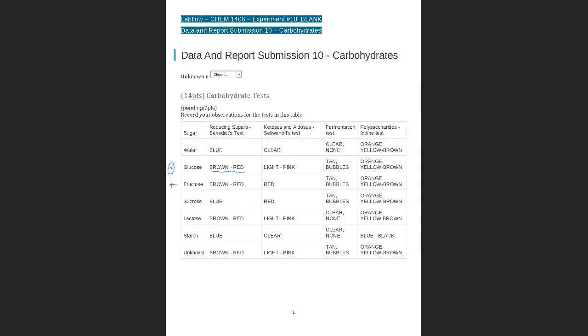Fructose, yes, fructose is a reducing sugar, so then it's positive. What happened with sucrose? We said at the beginning of the workshop, we show why sucrose is a non-reducing sugar. And here in the test, we see the color of the Benedict's reagent doesn't change.